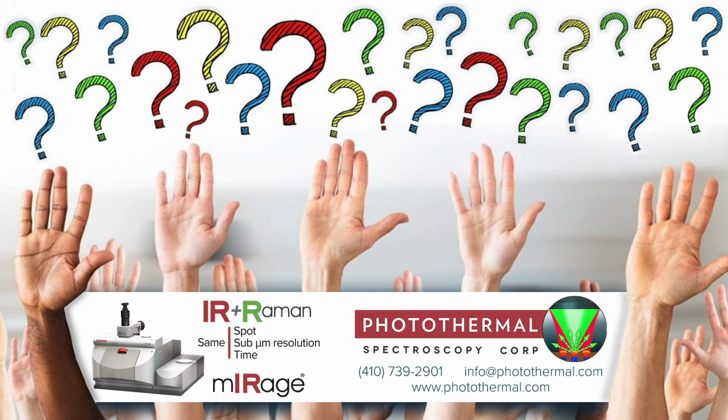In one of your slides, it seems you have compared OPTIR Raman, the Raman data collected from the OPTIR machine, with Raman data collected by a Raman machine. Yeah, from the microplastic, I could compare the OPTIR spectra with the FTIR spectrum, and then the Raman spectrum collected with a standalone Raman system and the Raman spectrum with the Raman option of the OPTIR. Did you see any bandwidth changes?